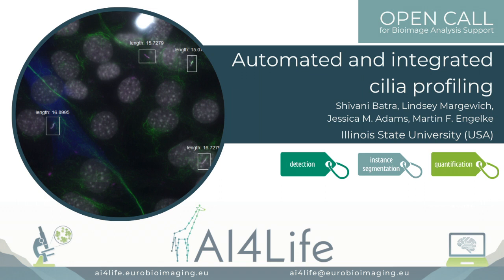The task here was to measure the motor protein intensity in a perinuclear region of the cell, and if that cell has a cilium associated with it, measure the length of the cilium. In addition, of course, cilia associated with non-expressing cells also had to be measured.